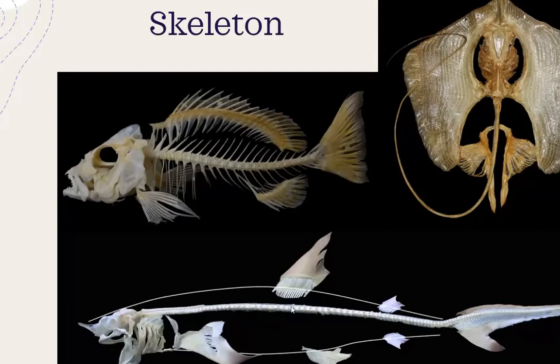And also with bony fish, we can remove the fins first, because the fins have a connection with the body by ligament. Then you can take care and remove it all. Before you remove it, you can take a photo first to fix the position. When you put it back, if you don't have any picture, maybe you can mistake some of the positions of the bone.